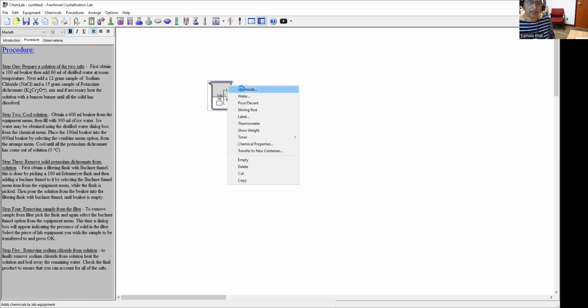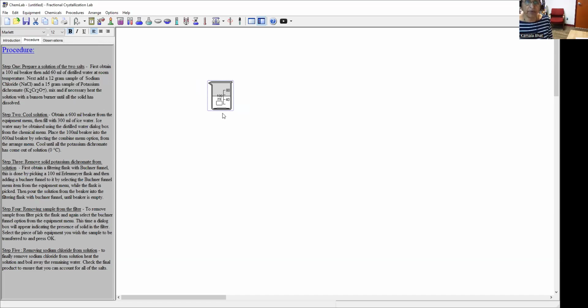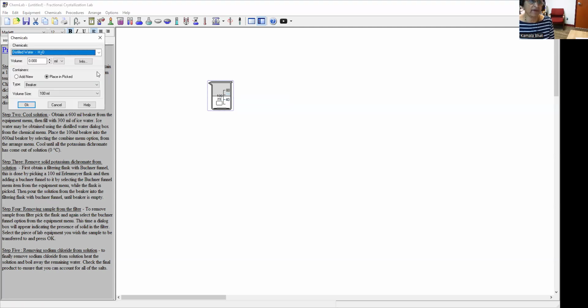Then again, I'll click and then add my salt in it. Read the procedure carefully, and then add the quantity they have asked.